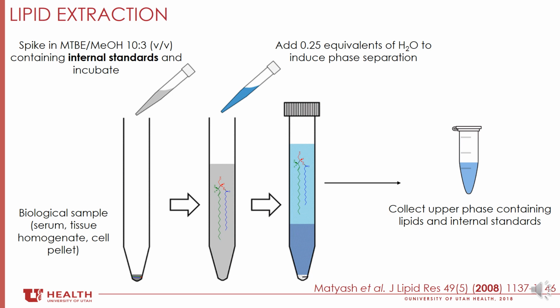It's also important to note here that we have instructed several researchers on this technique so that they can prepare the lipid extracts themselves, which improves the throughput and lowers cost on the researcher's end. Researchers would then only pay for instrument and analysis time when they prepare their own samples.